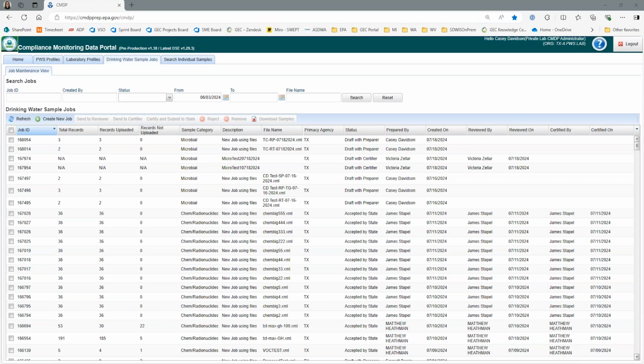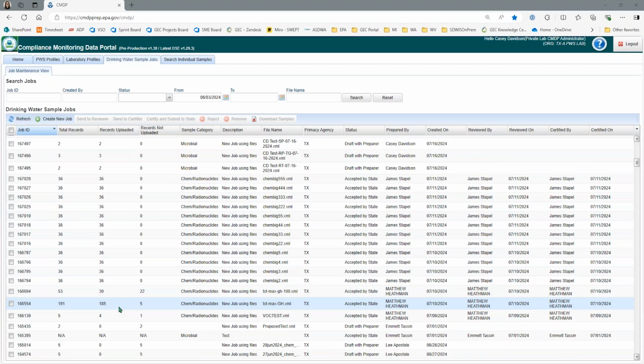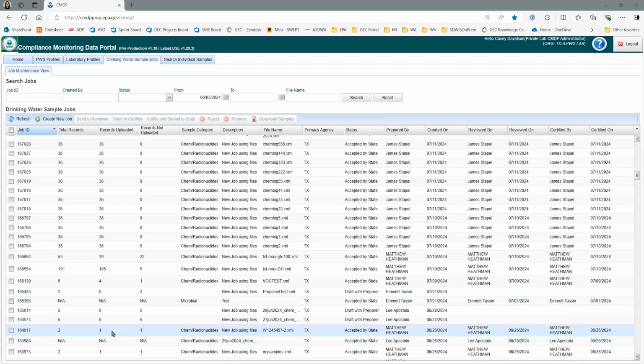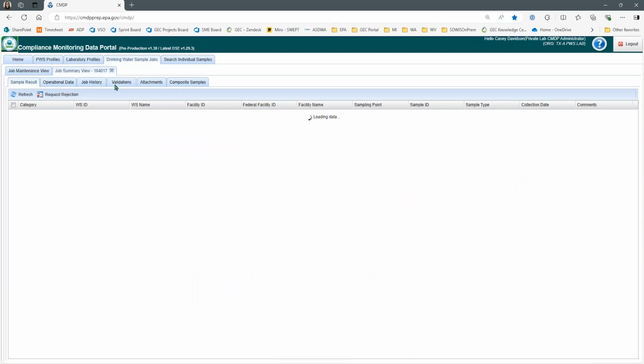And I think someone wants to know about the error messages. It's just saying what the error is, but does it tell which row is the error? Yes, it did show, I believe, since I don't have it anymore. Let me use an old one. You can go back and open the one that had 5 errors from me.